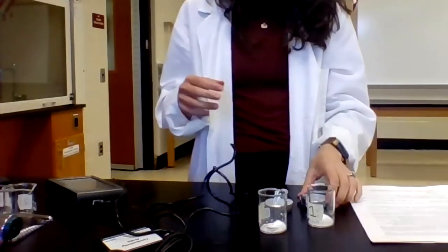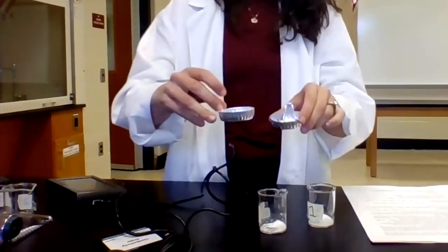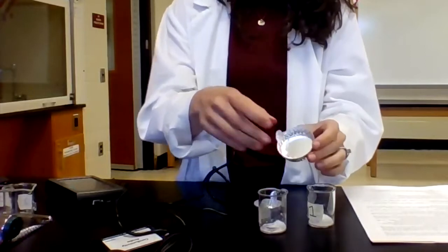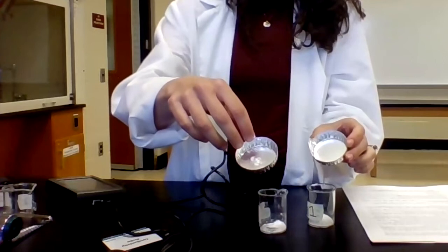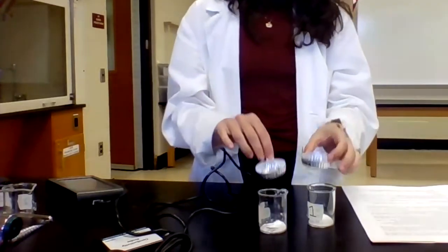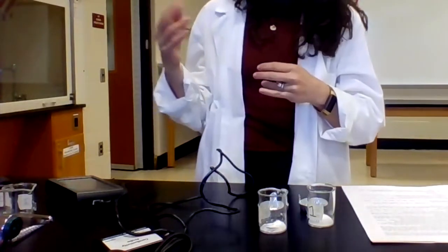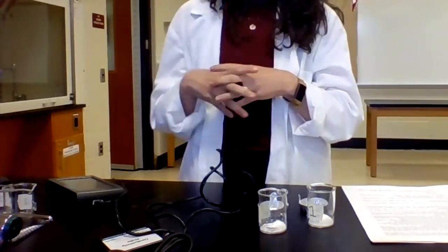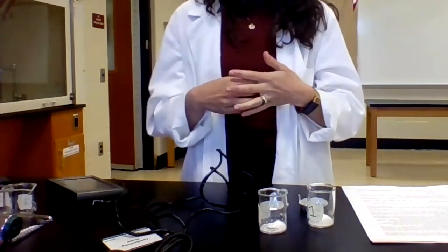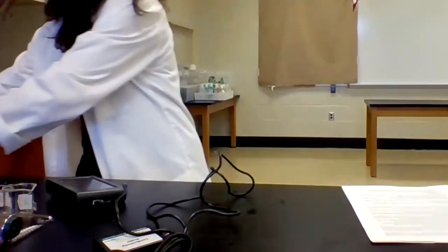All right, so I've now tested the melting point using the Bunsen burner, and what we can see here is that solid 1 still did not melt. Same with solid 2. So neither solid 1 nor solid 2 melted. But again, the difference between ionic versus polar covalent isn't necessarily going to be determined just from melting point. So next what we want to do is test conductivity. So move these off to the side.